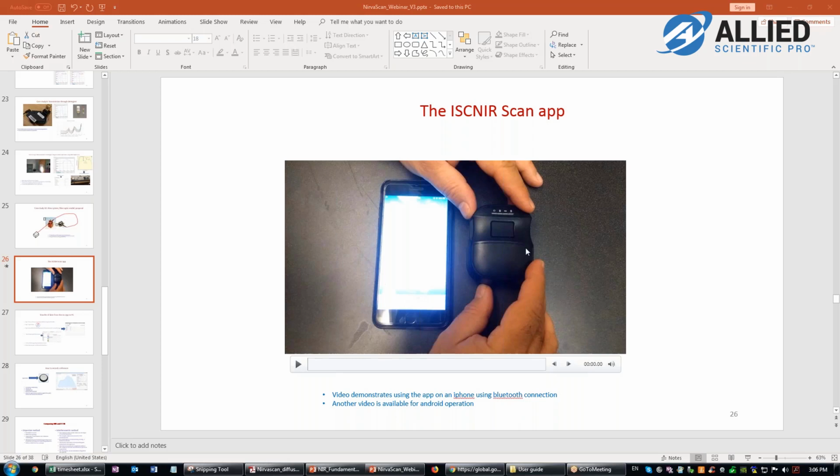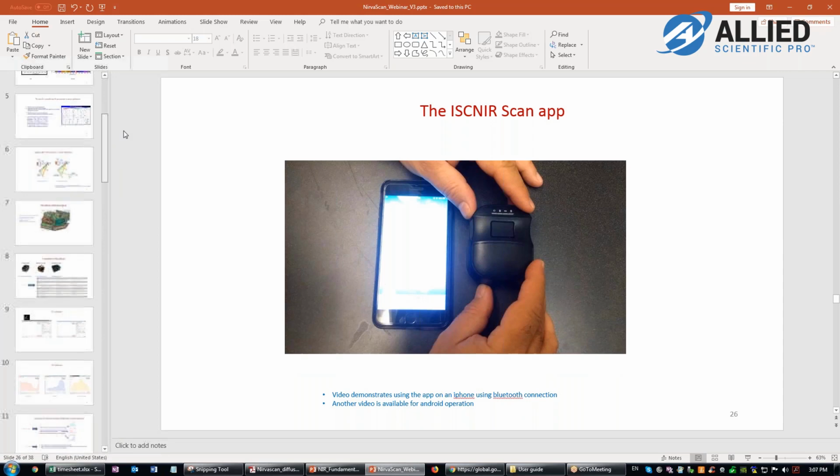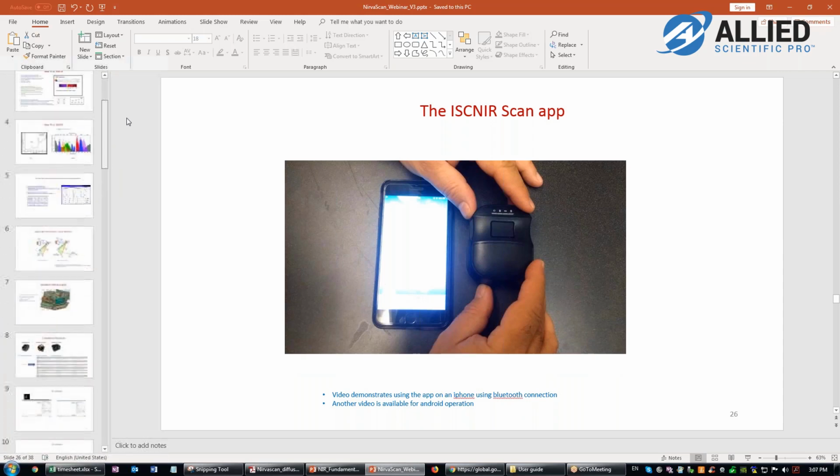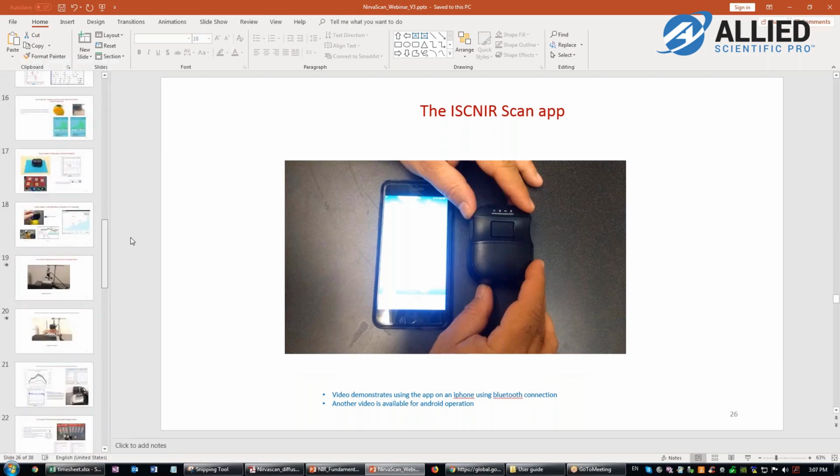Can you control the number of scans, related to, say, the resolution? You can, let me just go back to the PC software. I thought you said the scans were fixed at 6 scans, and I didn't understand that well. How many scans can you do? Can you change that?